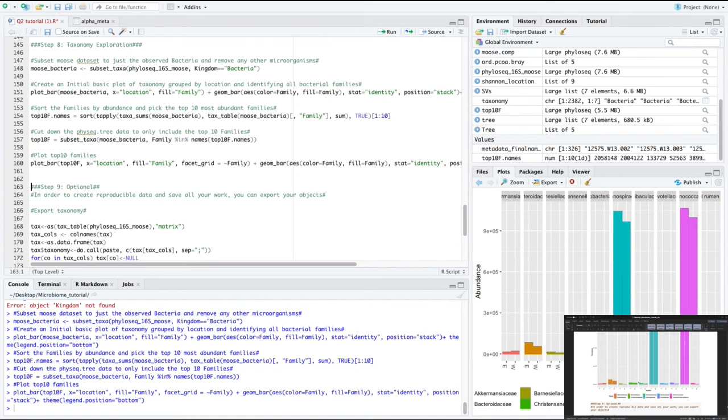So that's also another thing that, if you're a researcher and you're doing more research on this, you would go and look at, okay, what's going on with this specific one? You could do another bar plot.